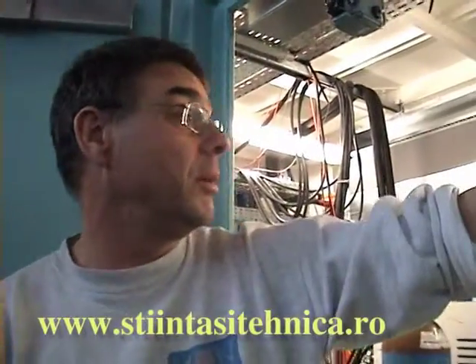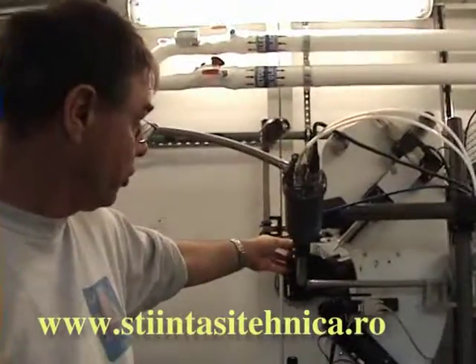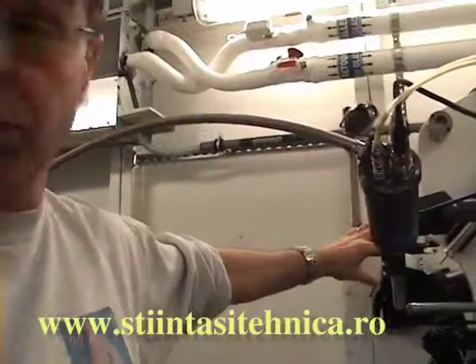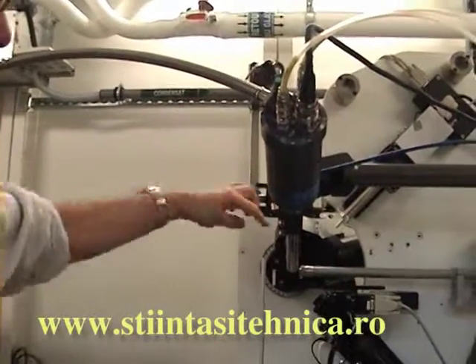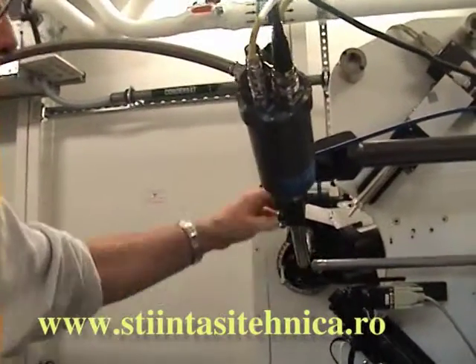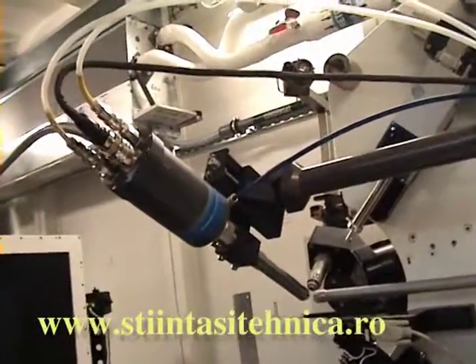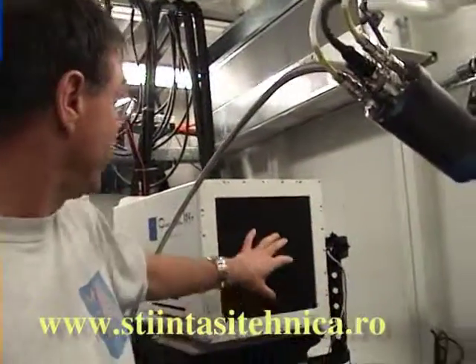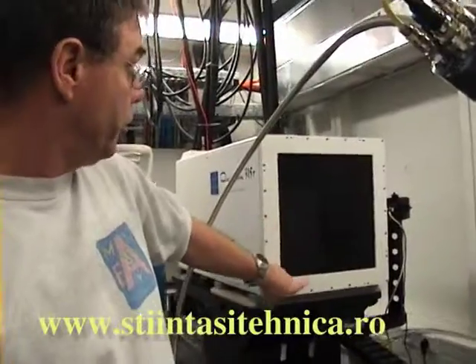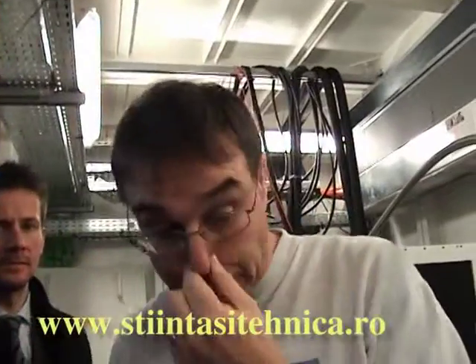And so we bring the beam down to a focal point around here, from which we can, using this device which is called a goniometer, move the angle of the crystal with respect to the beam, either by rotating around this axis here, or by turning it around an axis around here, or by turning it around this big axis. So we can examine these three-dimensional crystal objects from all the different orientations, and at the same time produce diffraction images which will have black and white spots on, basically.